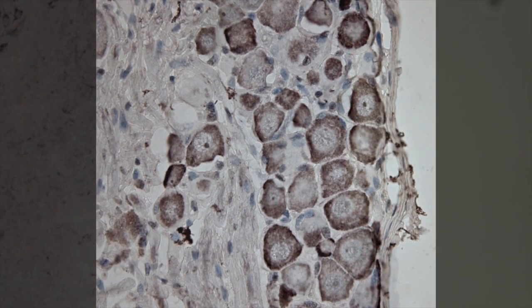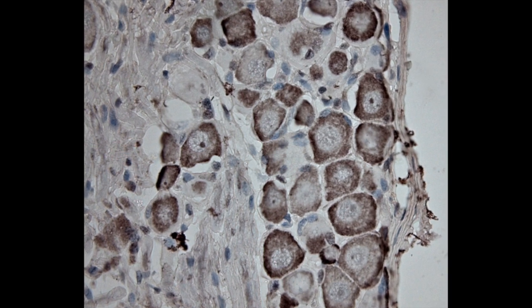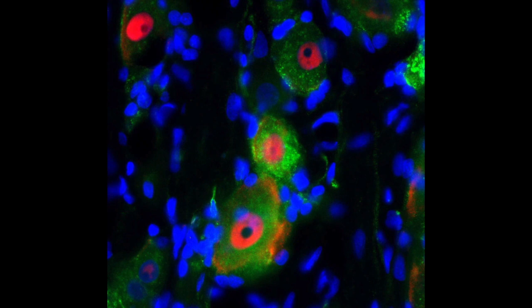Proper fixation of the tissue of interest is the most important step in any successful immunohistochemistry. The aim of fixation is to preserve the tissue's integrity prior to alterations caused by hypoxia. To achieve this, the vascular network can be directly used to quickly perfuse the target tissues.